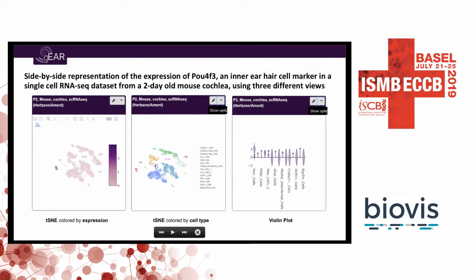We have this idea of a dataset-in-a-box, where once you're showing one dataset, the user can use menus and toggle between many different visualizations. This is Pou4f3 again in a t-SNE clustering — we can see it lit up in a particular cluster. You can toggle to cell-labeled t-SNE or violin plots. These are all different visualizations of the same dataset.